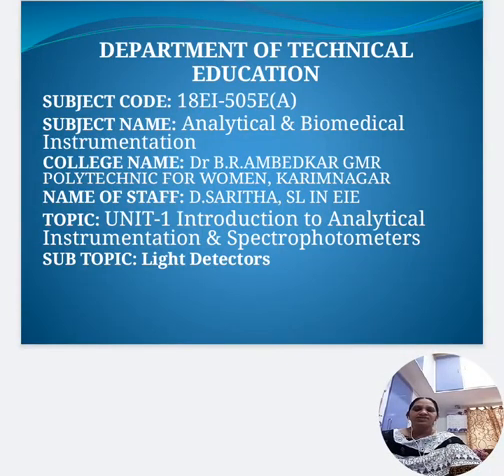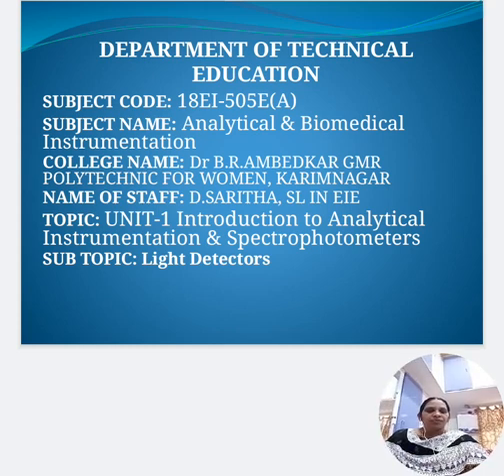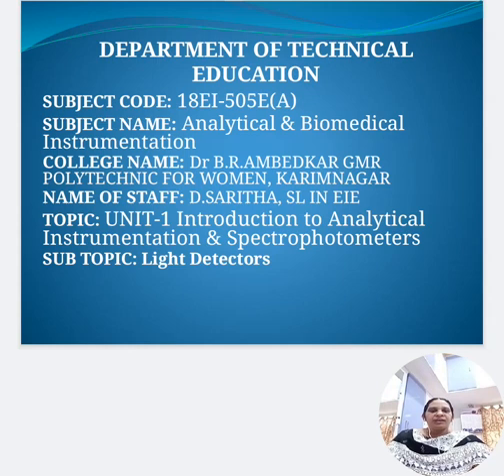Good morning, students. Today I'm going to deal with the topic light detectors, from the unit Introduction to Analytical and Spectrophotometers.